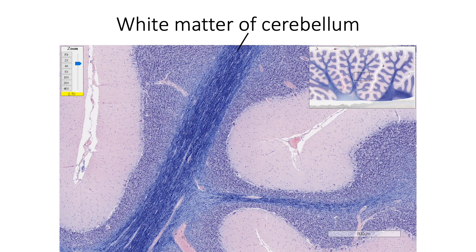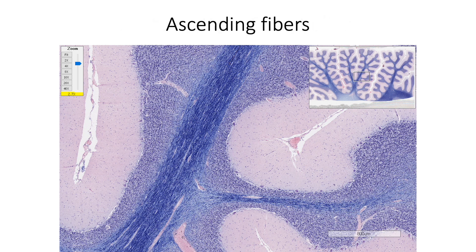This is a Luxol blue stained section of cerebellum showing the myelinated fibers in the white matter of cerebellum. Ascending fibers are broadly grouped into two types. First type is the climbing fibers.